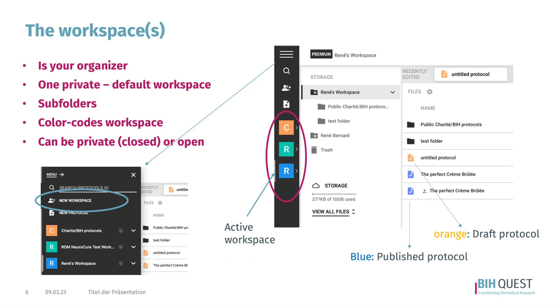When you start, it will take you to the workspace. This is basically the place where you find your organizational structure within Protocols.io. There's one default workspace, which is a private one — that's a good starting point for creating protocols. It will also list protocols that have been published with different colors. You can use subfolders for different projects where you keep your material, or organize folders for media such as videos — however you want to be organized.